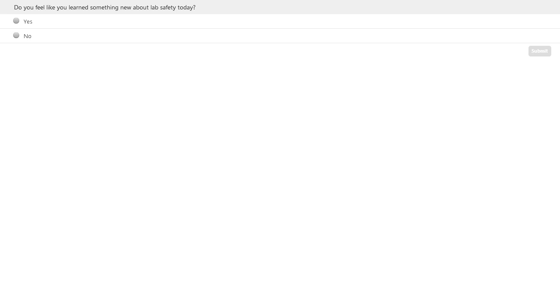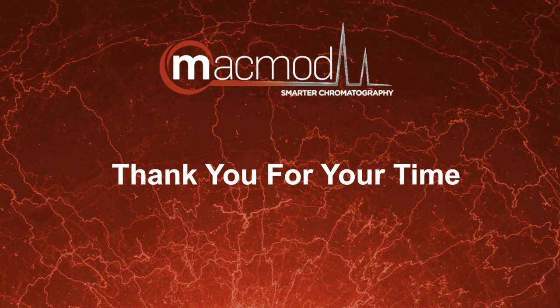Okay, now we're going to open it up to the audience questions. And Edward, of course, these are all for you. So the first question that I have for you is, do the caps reduce 100% of the low boiling point solvent evaporation?